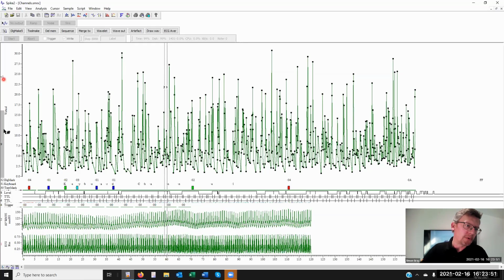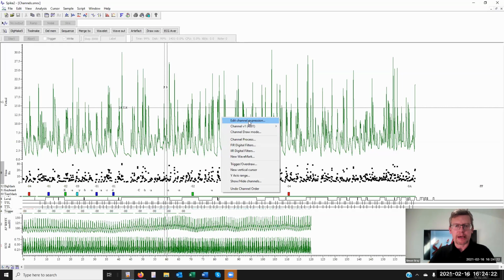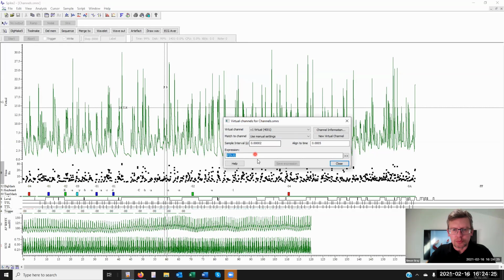And why a waveform? Well, what we may want to do is use cursors to measure features of this waveform, perhaps with an Alt and key 1 to put a cursor on the screen and find when we go above certain levels. That isn't easily accessible on the instantaneously drawn channel. So converting it to a waveform is very useful there. What else have we got?